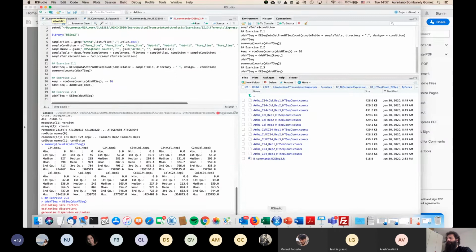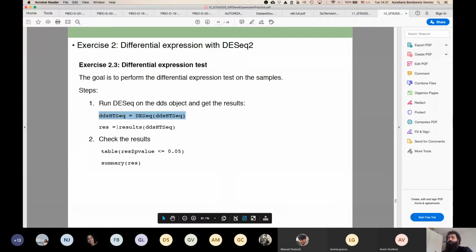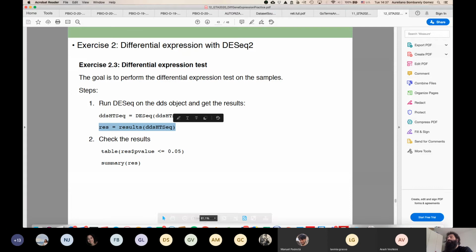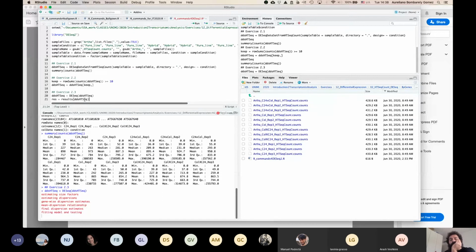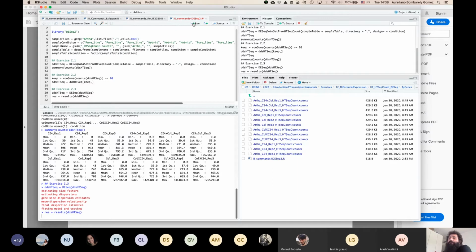And then we want the results. Okay, results.